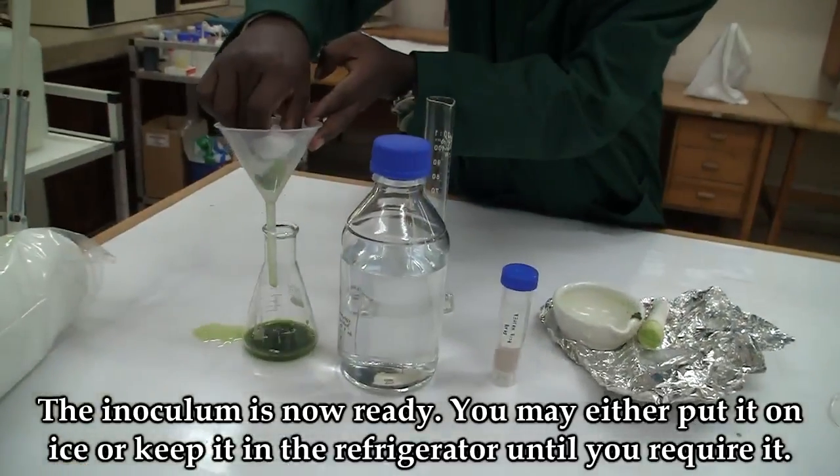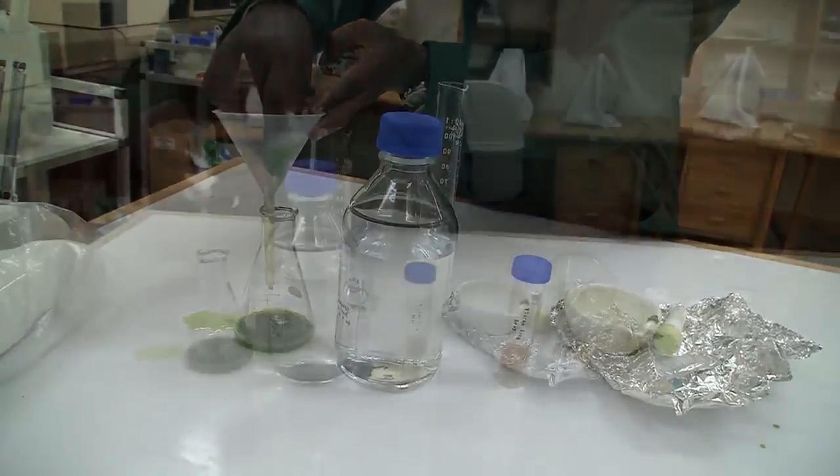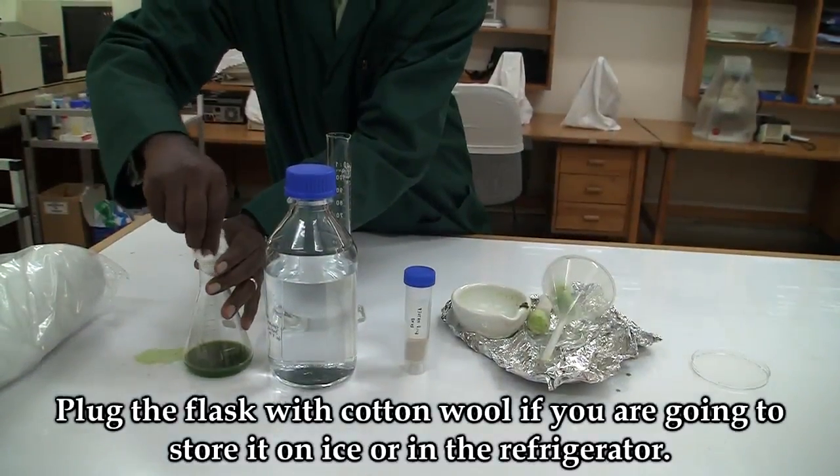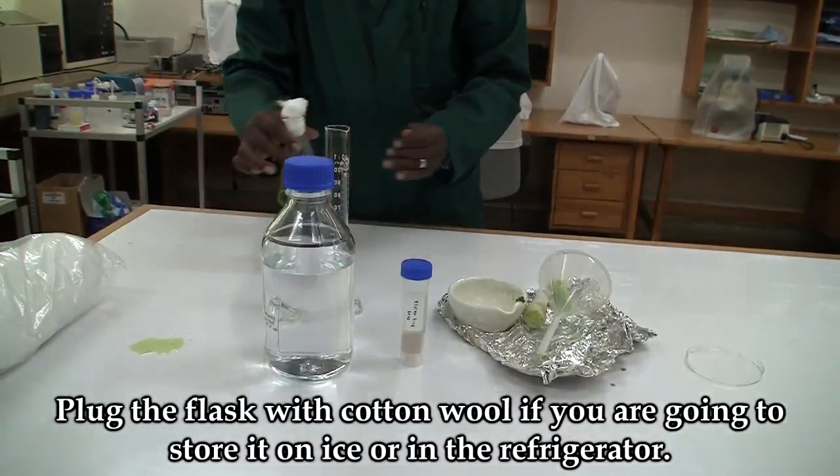You may either put it on ice or keep it in the refrigerator until you require it. Plug the flask with cotton wool and then put it on ice or keep it in the refrigerator.